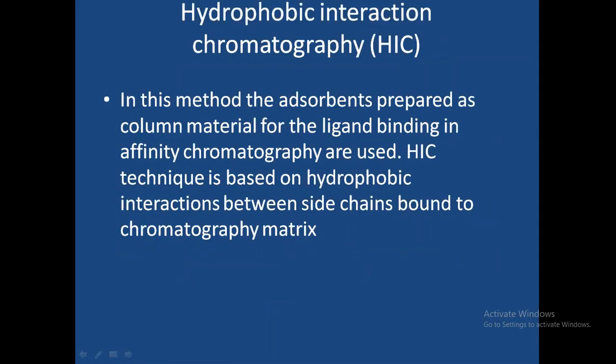Then hydrophobic interaction chromatography, which is abbreviated as HIC. In this method, adsorbents prepared as column material for the ligand binding in affinity chromatography are used. Hydrophobic interaction chromatography is based on hydrophobic interaction between the side chains bound to the chromatographic matrix.